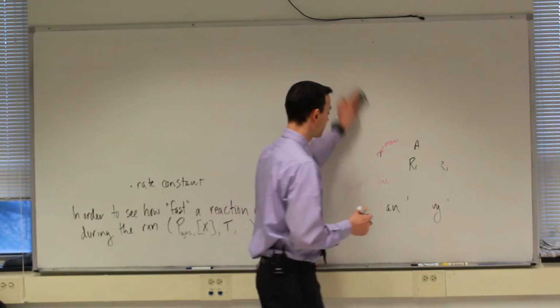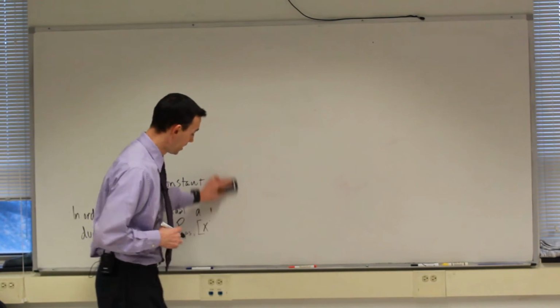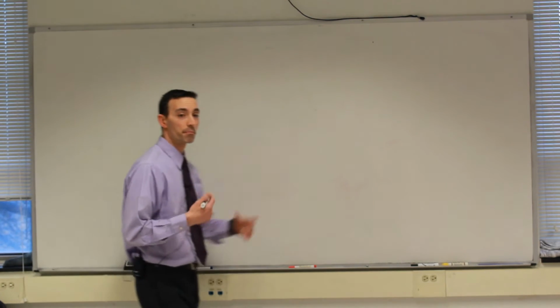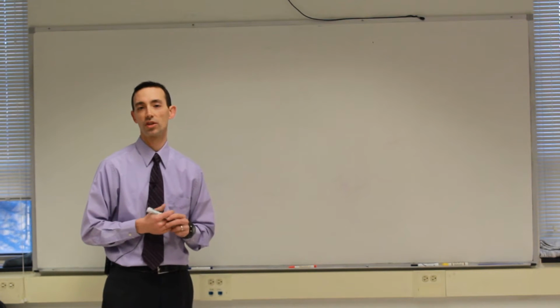And I very purposefully today wore this nice purple shirt and a purple tie to go along with it, because the chemical crystal violet is a purple colored dye. And the more dye that's present, the deeper the purple color is in solution.